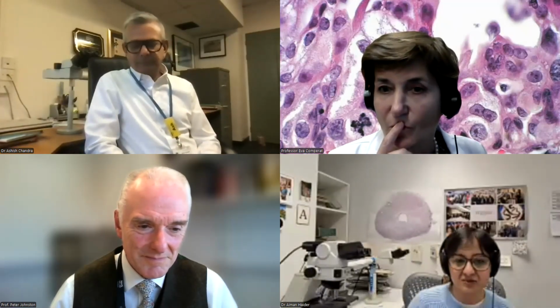I think I will also reiterate what both Ash and Eva have just said. Going into a macroscopic cut-up room is like a ward round for us in pathology. And I always stress the importance of looking up all the clinical details, the imaging of the patient, the previous MDT discussions, because then you know what can be smart sampling for the specimen that you've received. And a good macroscopic examination with all these details in mind always helps you save on those blocks.